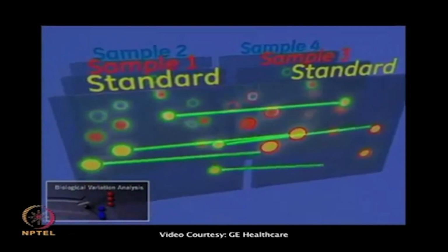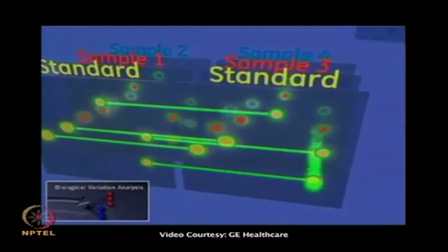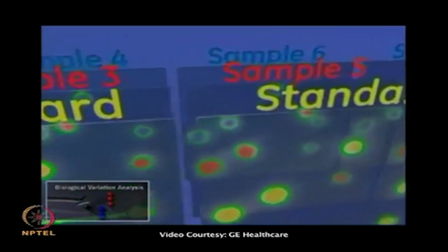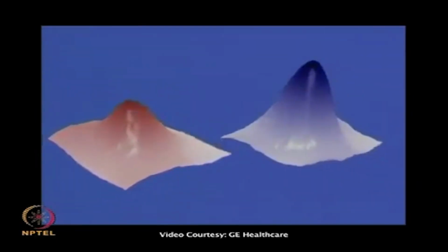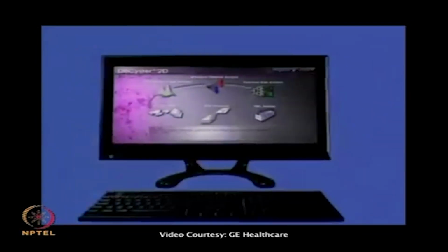It matches each and every individual spot, and it will give you the final data. Then these BVAs can be analyzed further in EDA, that is extended data analysis.